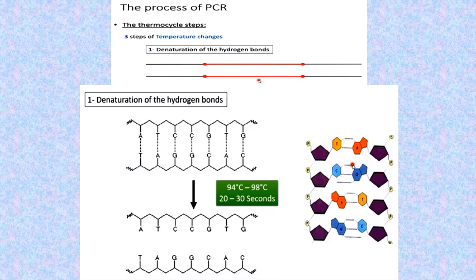As you know before, the 2 strands of DNA bind between them by hydrogen bonds. Hydrogen bonds may be 2 hydrogen bonds between A and T, or 3 hydrogen bonds between C and G. You see that 2 red colors, meaning that we need to copy this specific sequence.